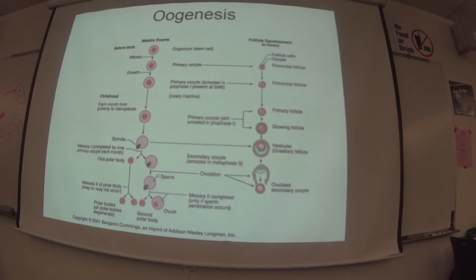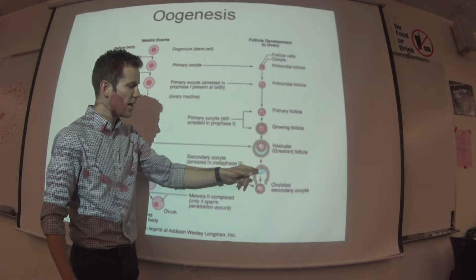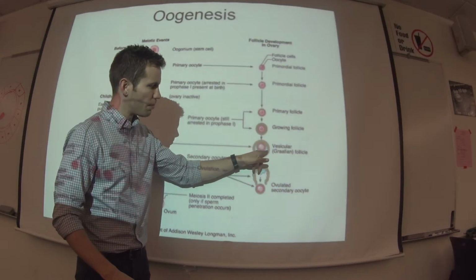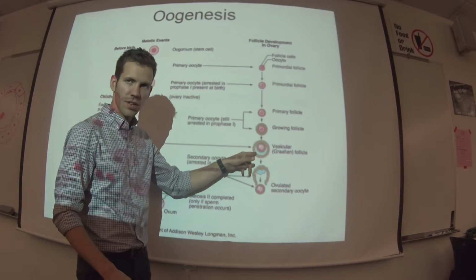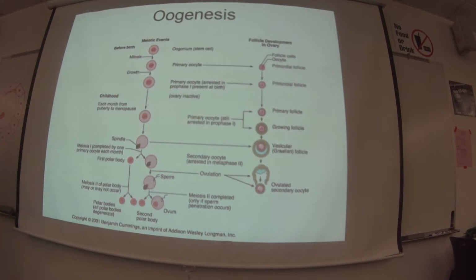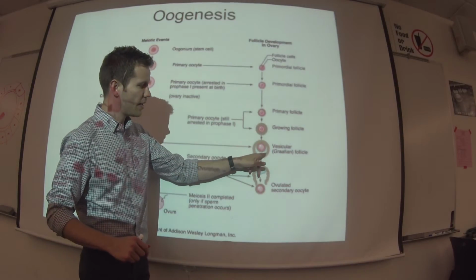But the distinguishing feature of a secondary follicle is that, yeah, sure, you've got a stratified follicle that grows, but then you get these little tears in it. And what it's doing is beginning to open up and form what's called an antrum. Once the antrum is fully formed, like you see in this picture, we call it a Graafian, mature, or vesicular follicle. There's a lot of names for this last follicle. I like mature because it's the last follicle. It doesn't get any bigger than a mature follicle. And again, that space on the inside is called the antrum.